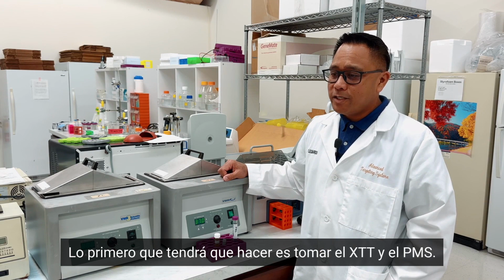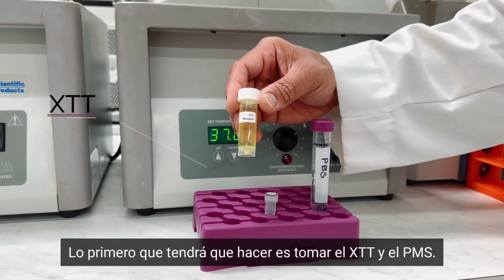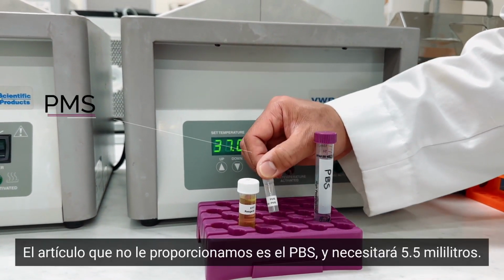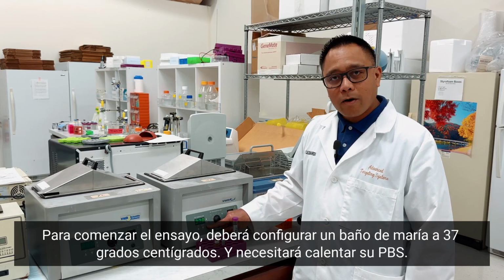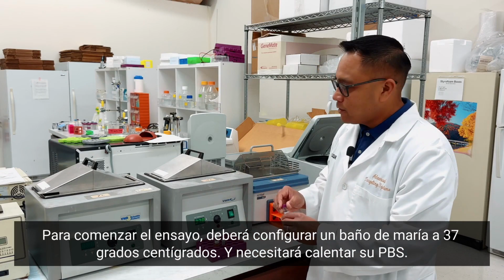So the first thing you'll need to do is grab the XTT from your kit and the PMS. Again, these items are included in your kit. The item that we don't provide you is the PBS, and you'll need 5.5 mils. To start the assay, you'll need to set a water bath at 37 degrees Celsius, and you'll need to warm up your PBS.